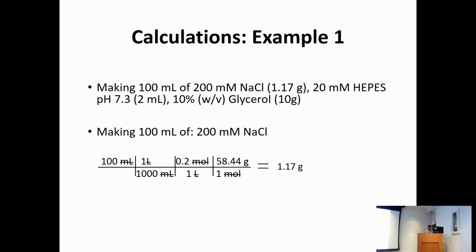Okay, this one is how to document the calculations in your lab notebook. What I'm showing here is the major thing. Think that you're preparing a sample and it's not working the way you're thinking.